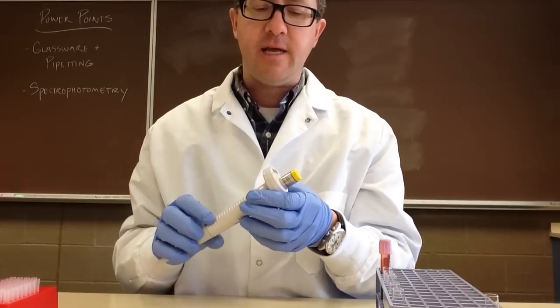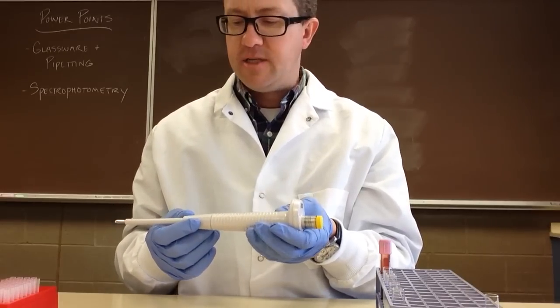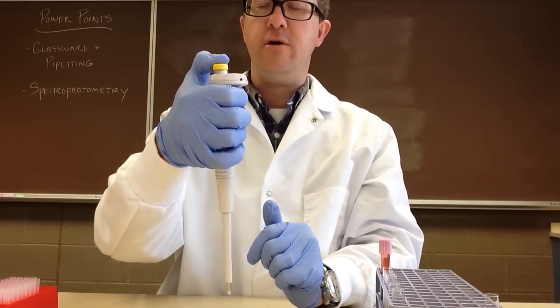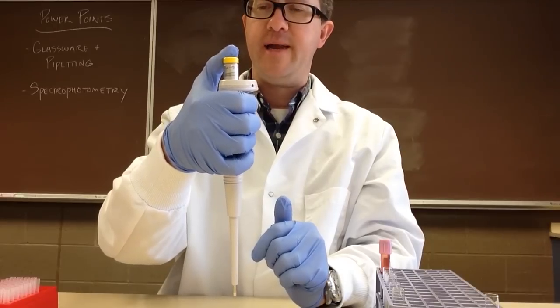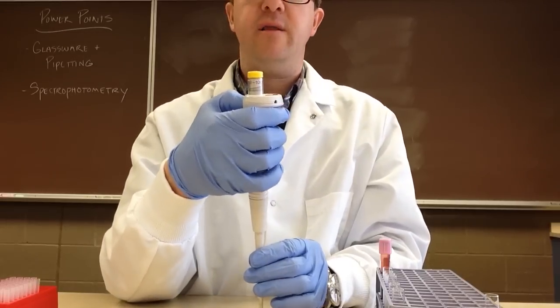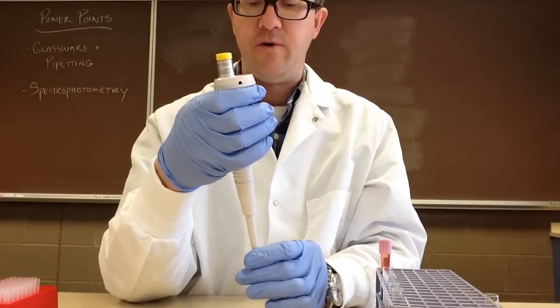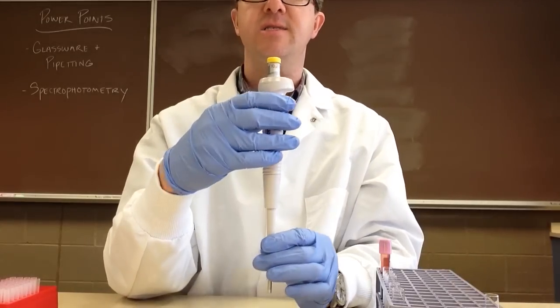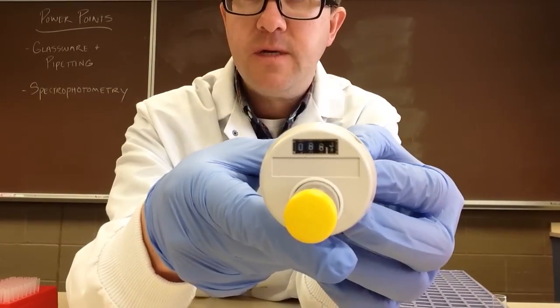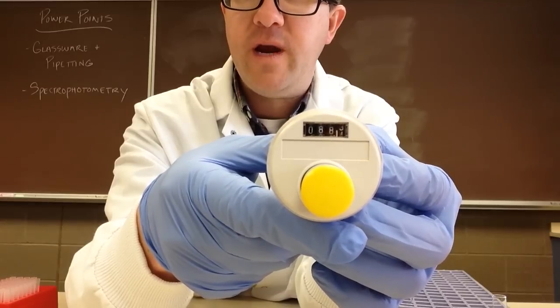Let's take a look at one or two of our micropipetters and talk about the parts. The first thing we have is the plunger, and this is what we draw up and expel our specimen with. The plunger has various stops, which come into play when we're doing the various pipetting techniques. This particular micropipetter is adjustable — it has a meter on top and we can adjust it.